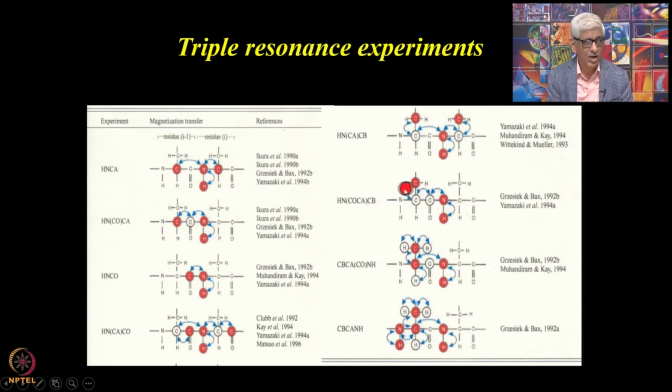Okay. Detecting means we have to have a frequency label, and the T1 increment should correspond to that particular chemical shift, and that is what determines which nucleus you are going to detect. Okay. So, and then the CBCA CONH, so these were the HN protons. Now here what we do, we start from the C beta once again, from here to here. From the C beta you come here, from the C alpha also you start here. So both will come here, and from this you go to the nitrogen, and from the nitrogen you go to the amide proton, and you detect the signal here.